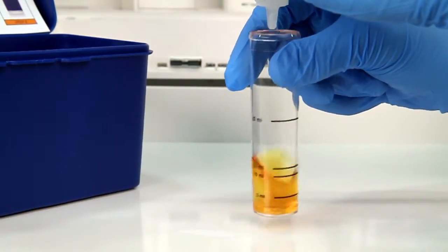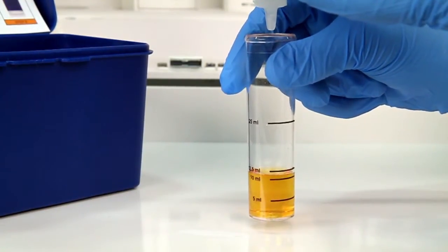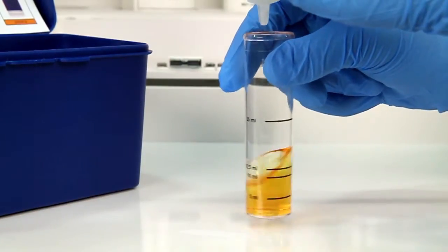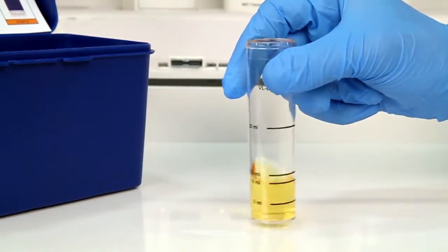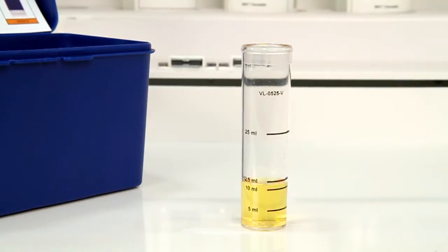The titration is complete when the sample turns a pale yellow color. Write down the number of drops used. You will need this number to calculate your results at the end.